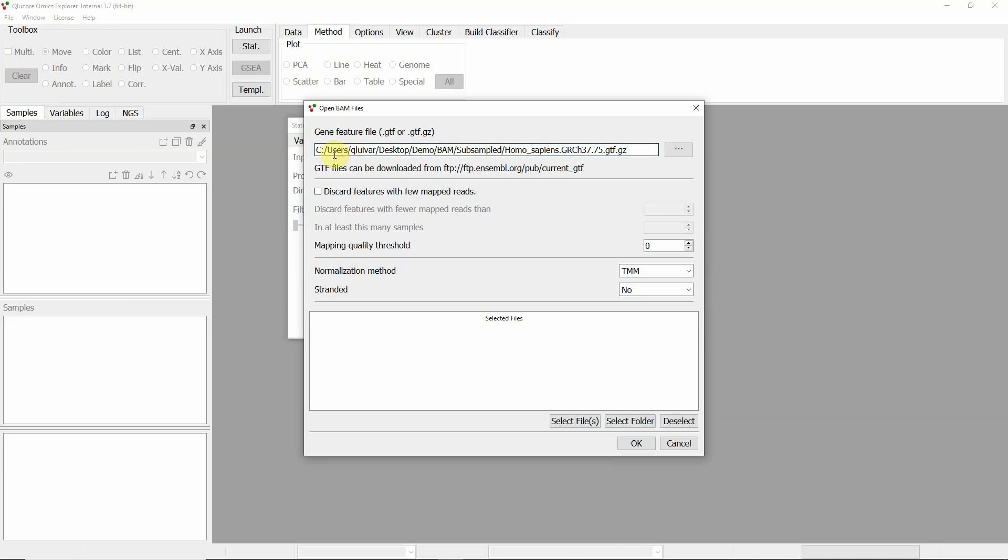The options to choose are based on your experiment and your study objectives. For this example, we decide to not discard any features.